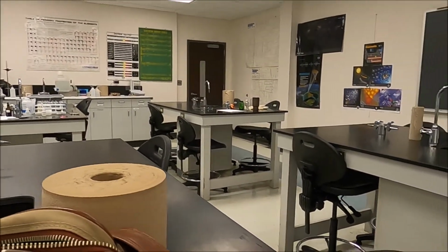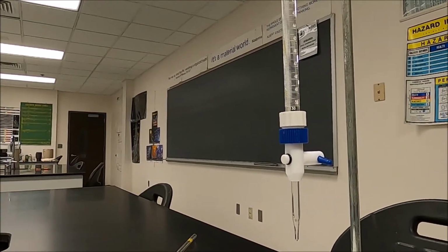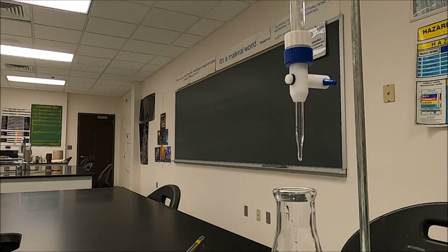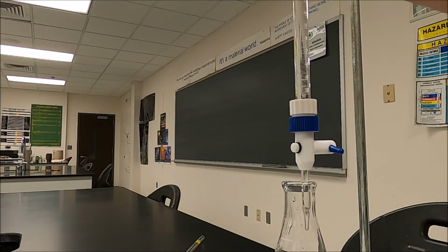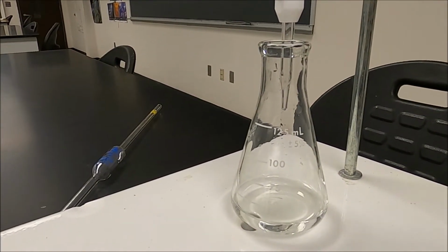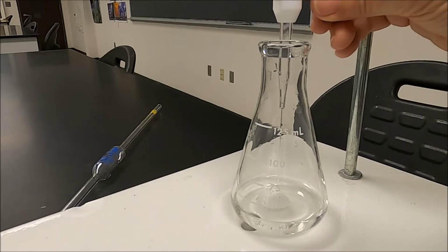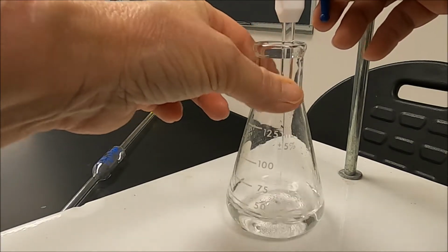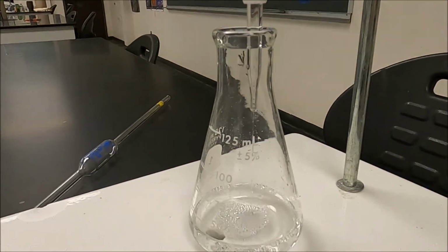I'm grabbing my data table so that I can write down the data just like you guys are going to do. Let me flip to the right page. Acid-base titration. All right, now I'm going to lift up my burette. I'm going to put my Erlenmeyer flask in there. I'm going to lower my burette down until the tip is inside the Erlenmeyer flask. Okay? So now we're going to titrate. So what that means is I'm going to be adding the base into the acid solution, okay? And I want to kind of swirl as this happens, and what I'm looking for is the appearance of pink.